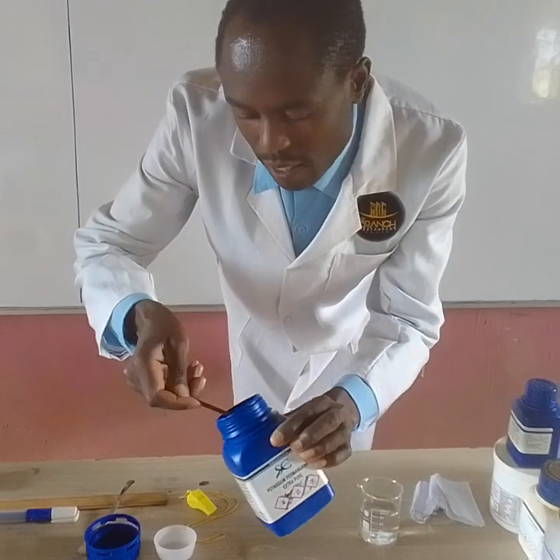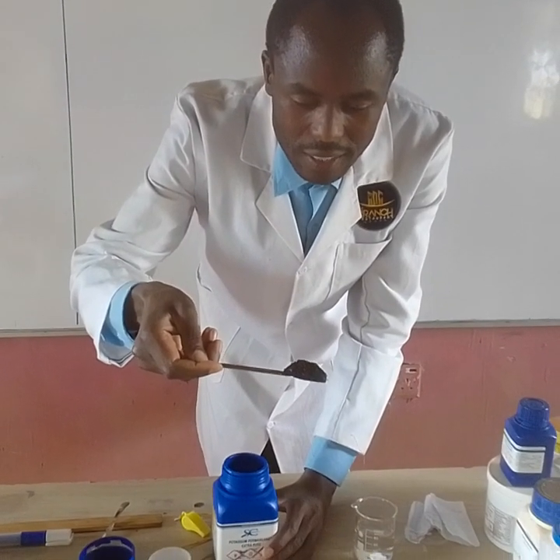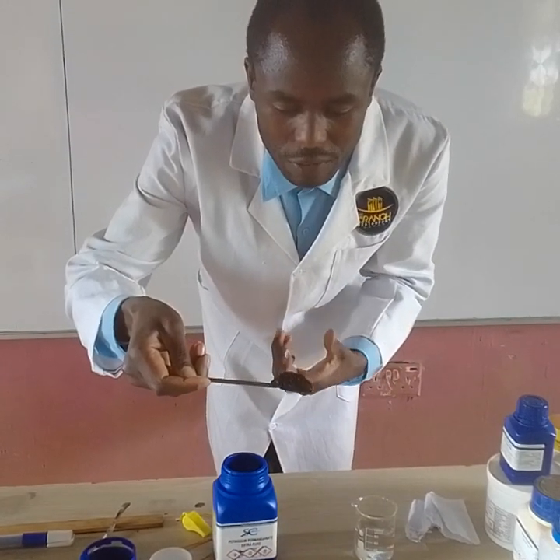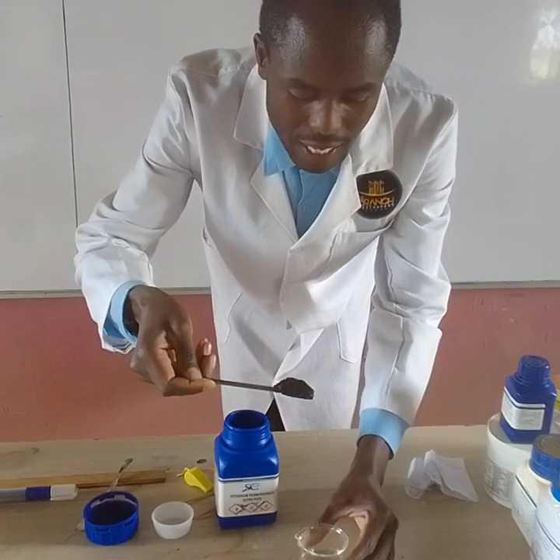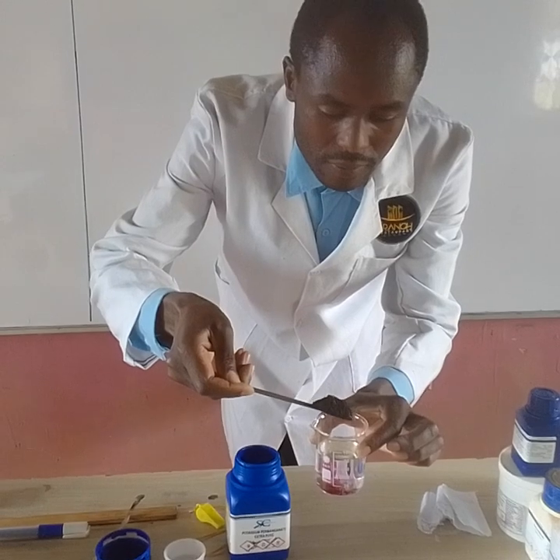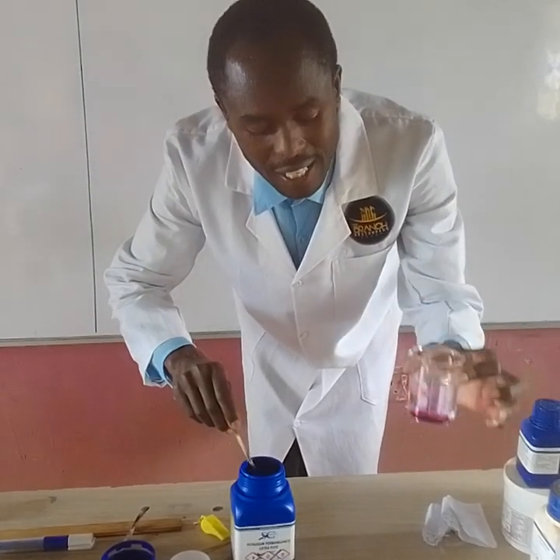So my students, this is now the solid potassium permanganate. You can make the observation. The solid is purple. It is purple in color, or we talk of purple luster. It shines. But if you are not very careful, you may think it is black. But to confirm that it is potassium permanganate, I have to spill some crystals into this distilled water. Just see. So the solution turns purple. Is it okay? So that is it, my students. So potassium permanganate is colored purple.